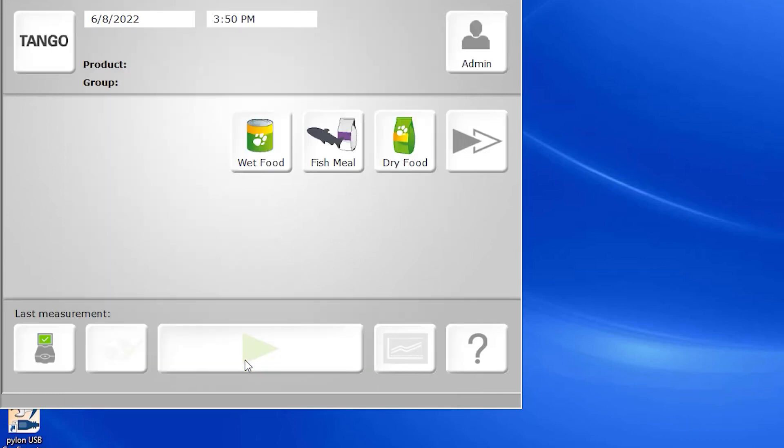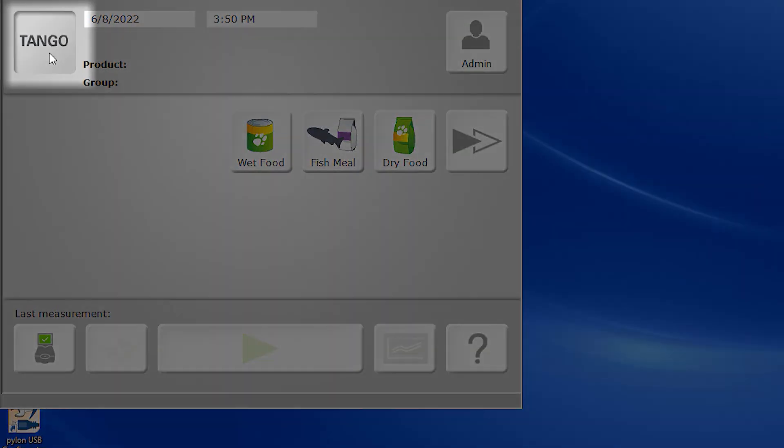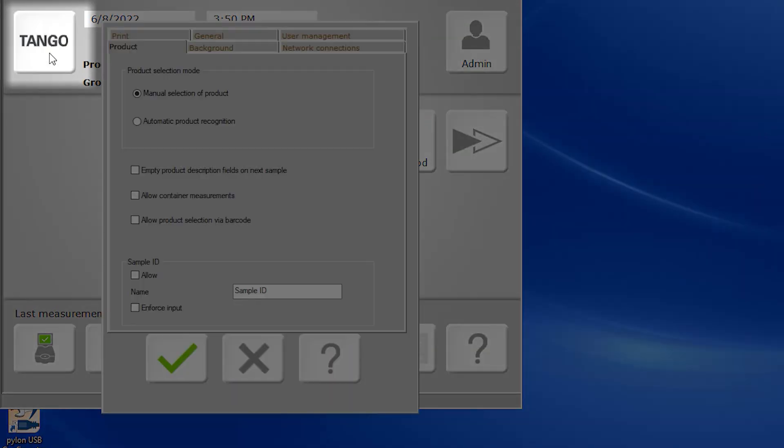Here we're looking at our main interface. This is the primary screen in which you'll be working within the GUI whenever you're running samples.